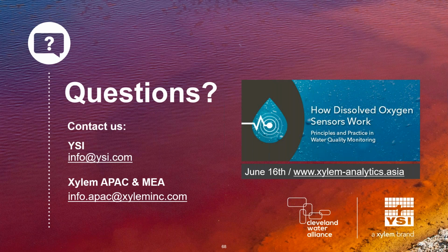Okay, terrific. We touched on this briefly before, but when calibrating, is there a specific buffer to start with, for example, pH 7, 4, then 10 sequence? No, I think as long as you start with 7. Personally, I start with 7 and then I grab whichever one is closest to me for the next one. Again, 7 allows you to troubleshoot the most easily, and then we're starting from the neutral and working our way out. It's just the best way to go.